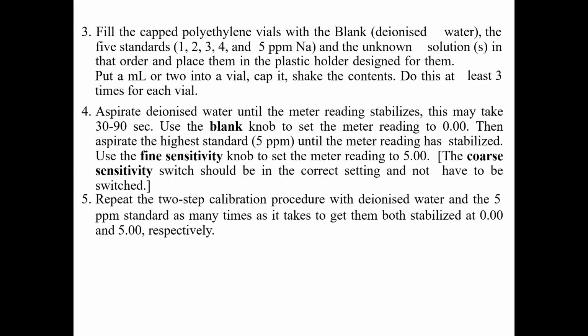This may take 30 to 90 seconds. Then use the blank knob to set the meter reading to 0.00. Then aspirate the highest standard, 5 ppm, and use the fine sensitivity knobs to set the meter reading. Okay, this is the SOP. Repeat the two-step calibration procedure with water and the 5 ppm standard as many times as it takes to get them both stabilized at 0.00 and 5.